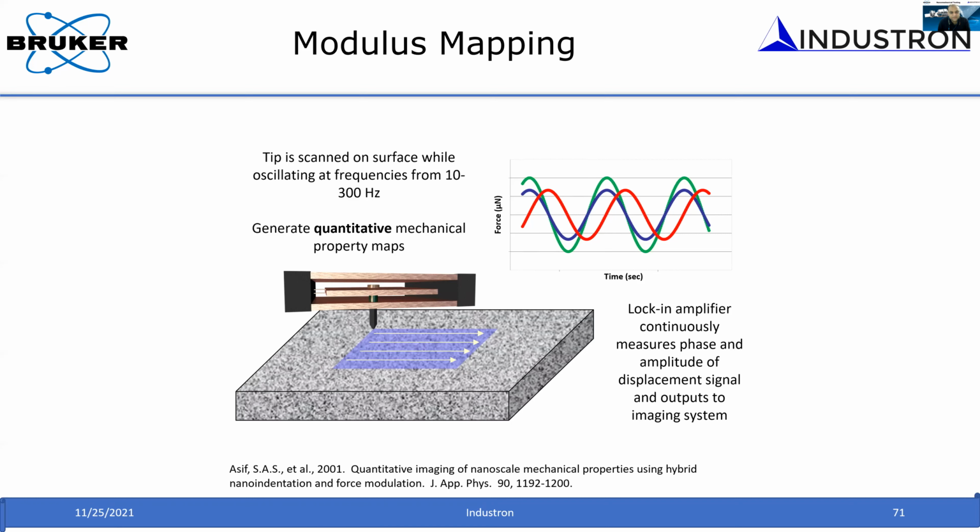Can DMA be used for both metals as well as non-metals? Yes, DMA can be used for polymers, ceramics, even biomaterials.